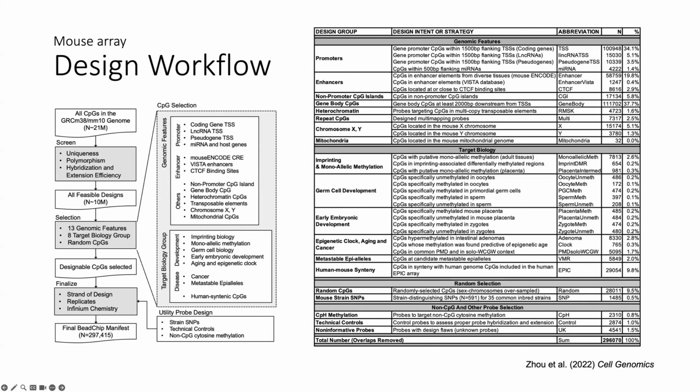So I think I'm going to reframe my first question. I understand this can all be in one array, but from an application perspective, see the early development one, could it be a separate chip altogether so that it could have a specific application?